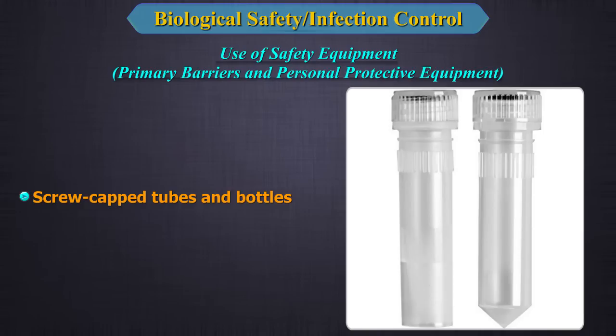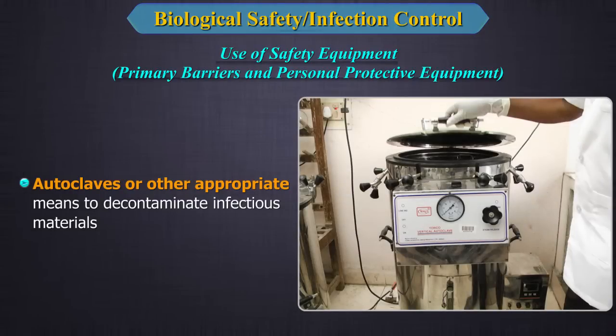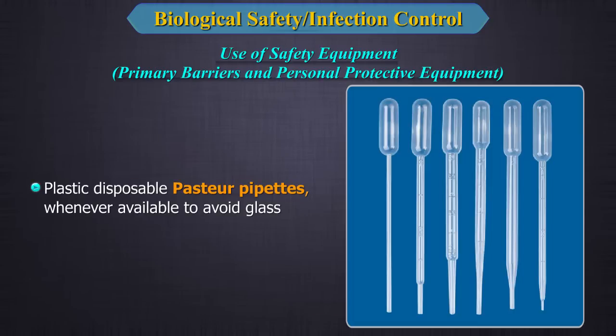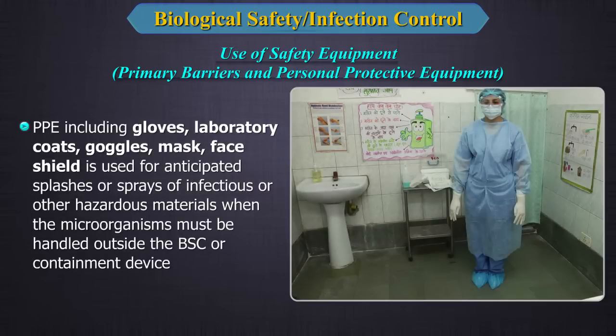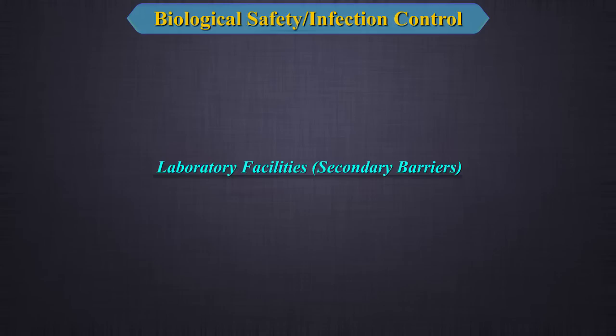4. Autoclaves or other appropriate means to decontaminate infectious materials. 5. Plastic disposable Pasteur pipettes whenever available to avoid glass. 6. PPE — personal protective equipment — including gloves, laboratory coats, goggles, mask, and face shield. These are used for anticipated splashes or sprays of infectious or hazardous materials when microorganisms must be handled outside the biosafety cabinet or containment device.